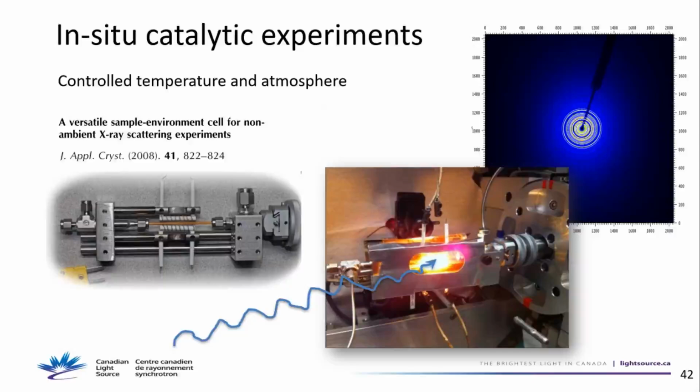What's the maximum pressure in the supercritical cell we are getting? 300 bar. Bars. So 1 atmosphere is 1 bar. How many did you want? Converting pressure units is all science. No, seriously, I get Google to do that for me.